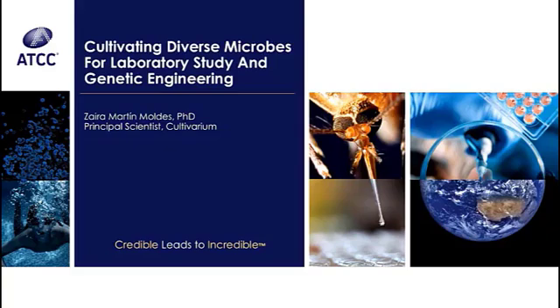In this presentation, Dr. Moldes will discuss innovative approaches to identify growth conditions and genetic parts in extremophilic bacteria and explore the Cultivarium Portal, a go-to digital resource for non-model microbes. She will highlight the Cultivarium Portal and how you can derive actionable insights for non-model microbes.